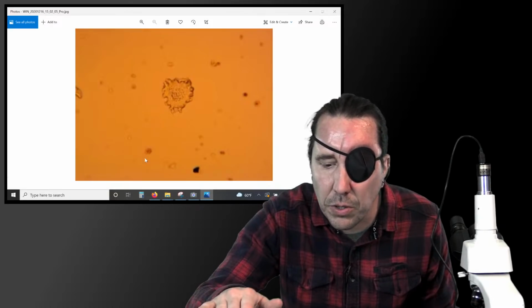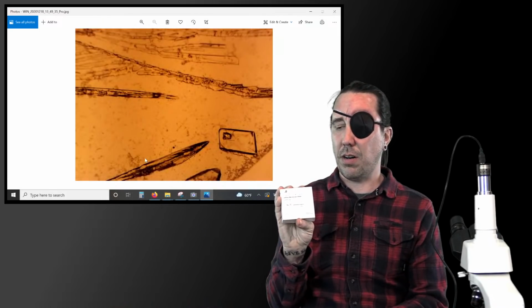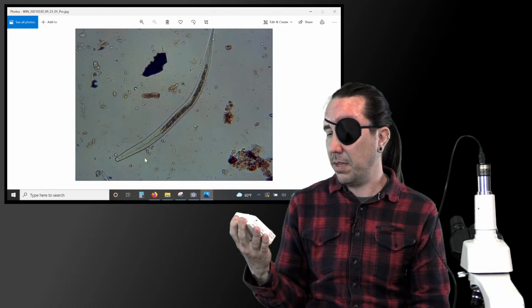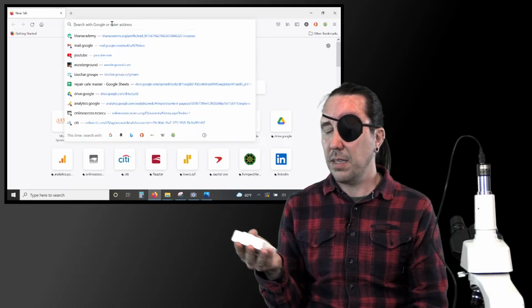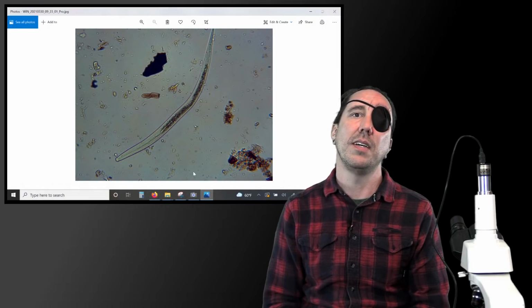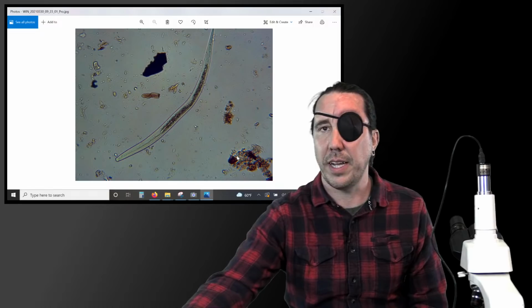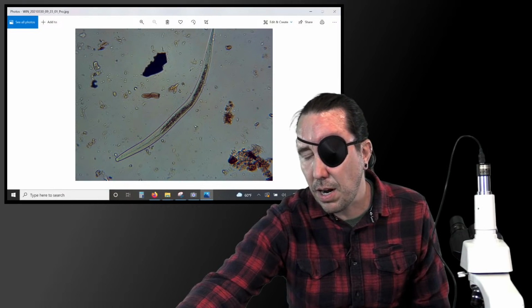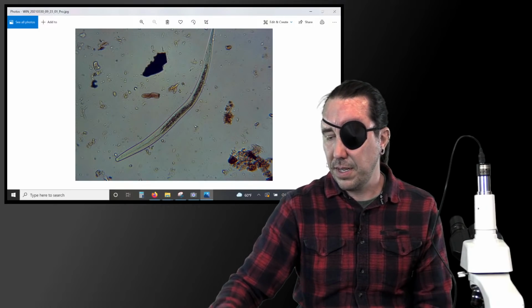When it comes to purchasing microscope slides, these ones are from Azer Scientific that is in Pennsylvania, I believe. They're made in Germany, but it was sold in Pennsylvania. They're high quality. Again, you get what you pay for. So if you're seeing extremely cheap microscope slides, I probably wouldn't buy those. I'd probably spend a little bit more to make sure that you're getting something of quality. And those are 1 millimeter by 75 by 25.